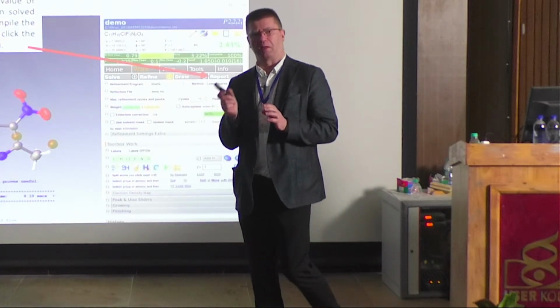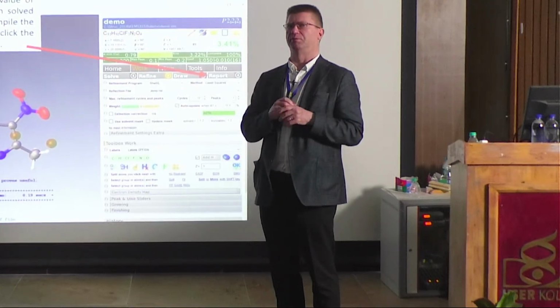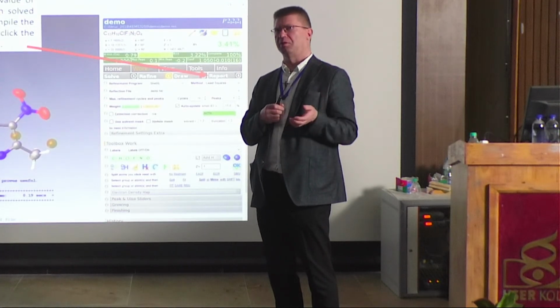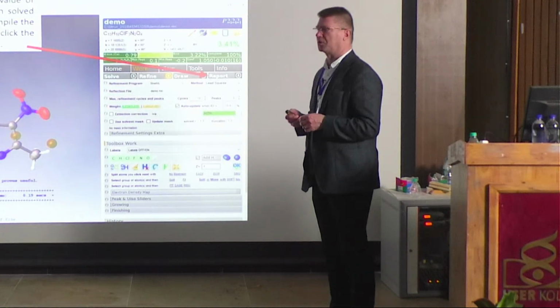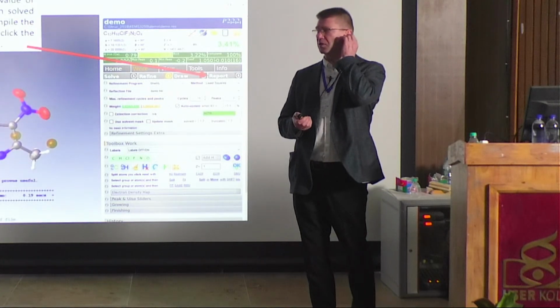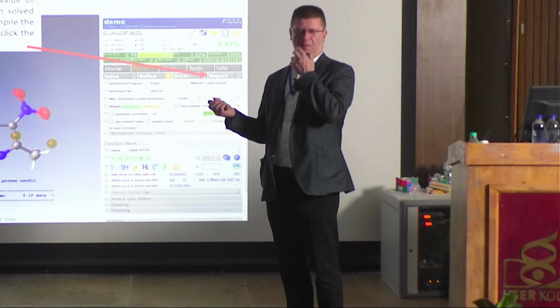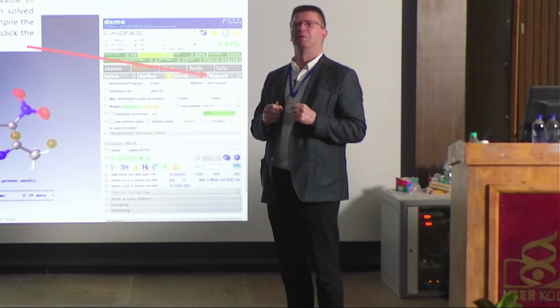Now, yesterday we went through the idea of how it really happens in a real-life program. We were able to solve the structure, and we were able to see that, okay, everything is fine. So now we move to the final step, the analysis and verification of the X-ray structure. This is very important. It is at least as important as growing the crystal, really being able to analyze what you have done. In many cases, this can be misleading.